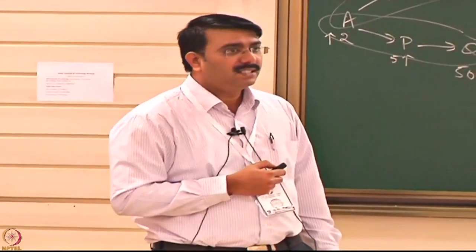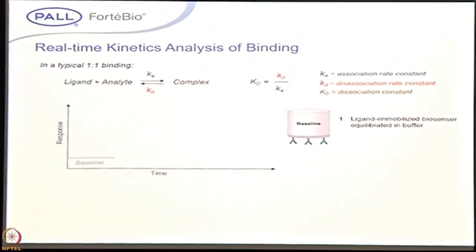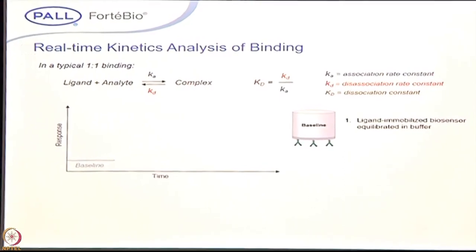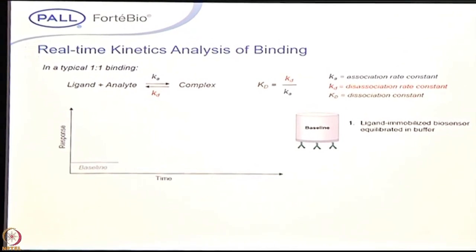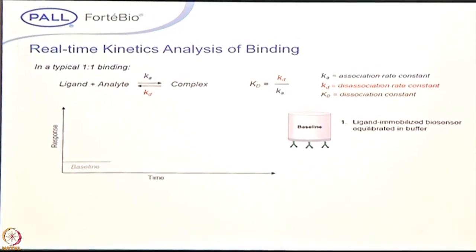So why people are moving to the label-free platforms is, this is the typical example, when there is a ligand, say compound A, and protein A and protein B form a complex, and this is the forward direction. When the complex forms, finally it dissociates once again into A plus B. So these label-free interaction platforms are applicable to reversible kinds of reactions.